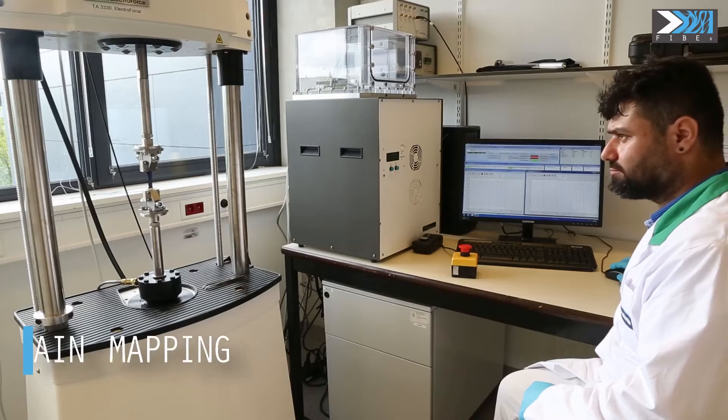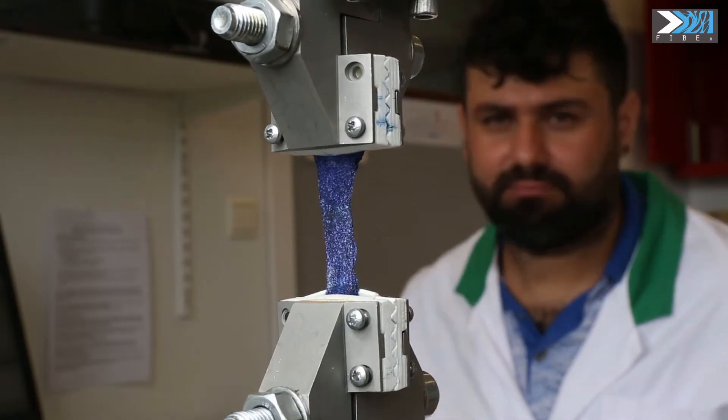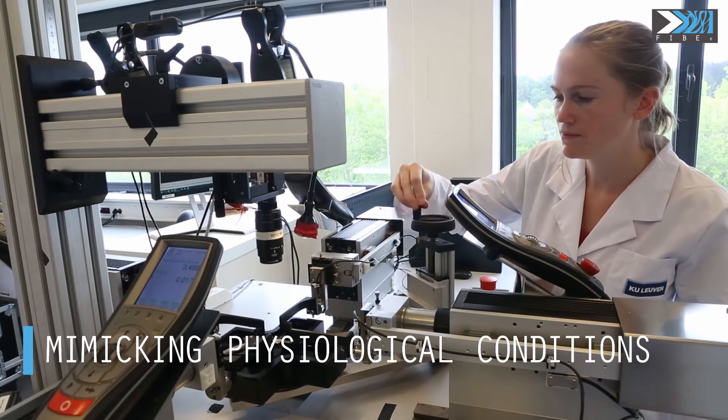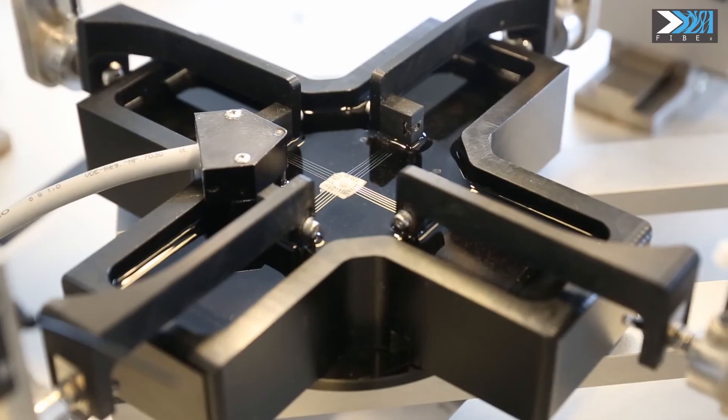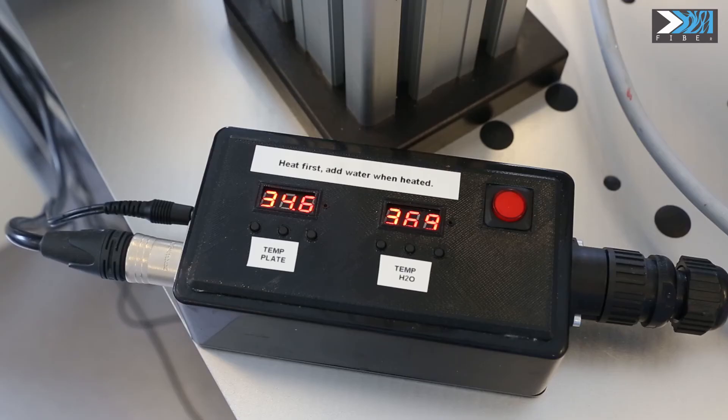During the mechanical test, we measure the non-uniform deformation of the sample by applying a speckle pattern to the tissue and using digital image correlation. We mimic the physiological conditions as closely as possible by performing our tests in physiological solution at body temperature.